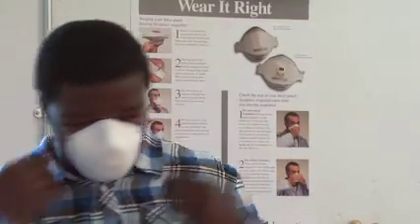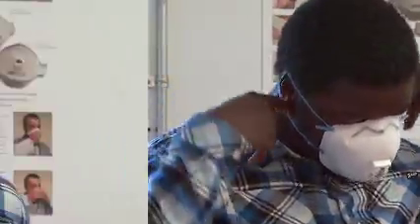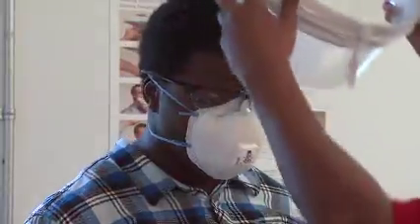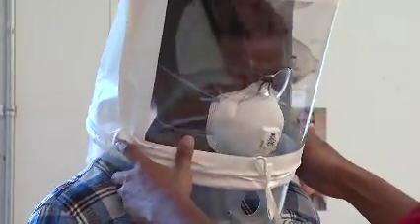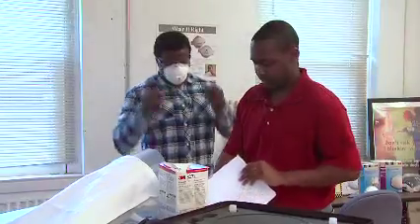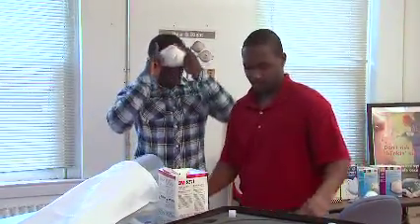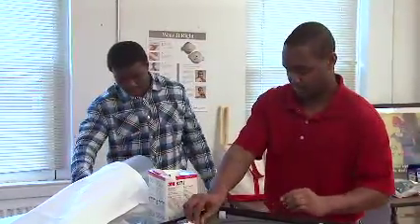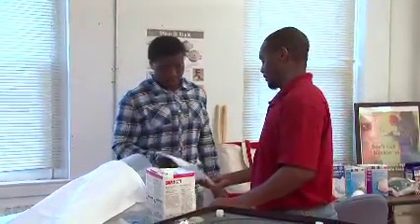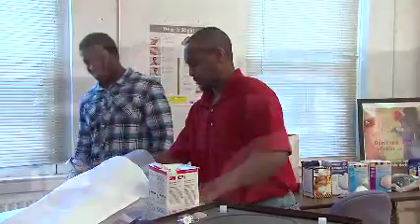If the respirator fails the fit test, then another make, model, style, or size must be tried until one is found that fits you properly. Therefore, your employer needs to provide you with a reasonable selection of sizes and models to choose from. When you've completed the fit testing process, it's very important that you know which make, model, style, and size respirator fits your face properly, and when and where you'll need to wear it for protection.